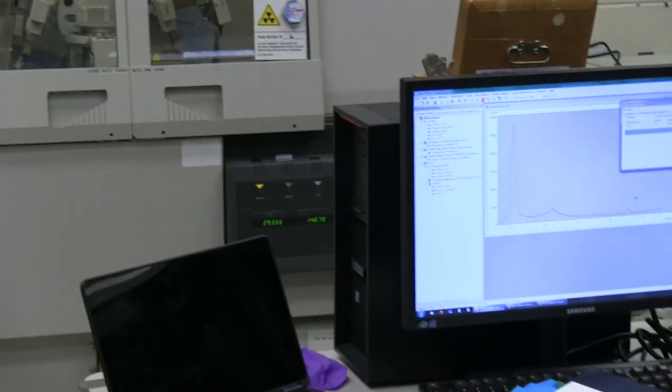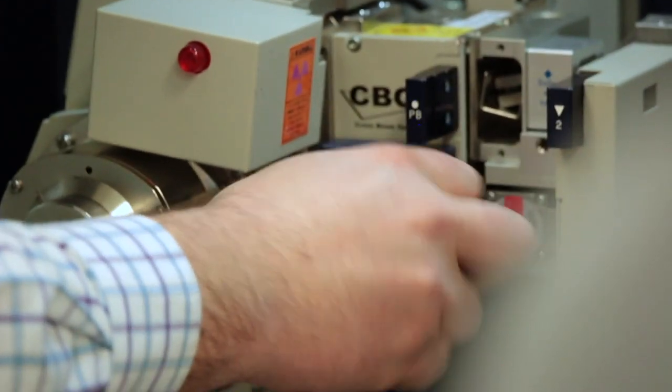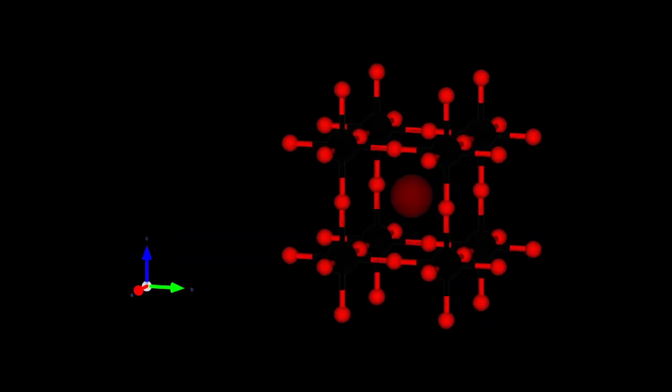The X-ray Shared Experimental Facility at MIT allows us to do just that. We can see the structure of a material down to its atomic scale to figure out how that material works and why.